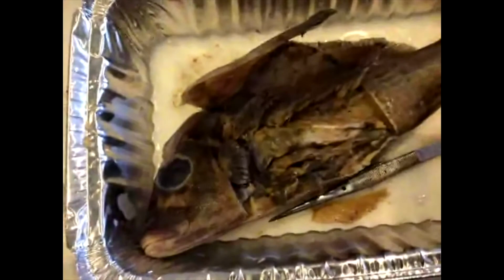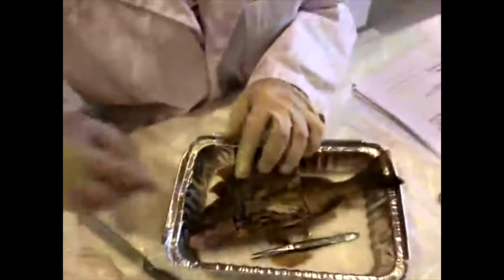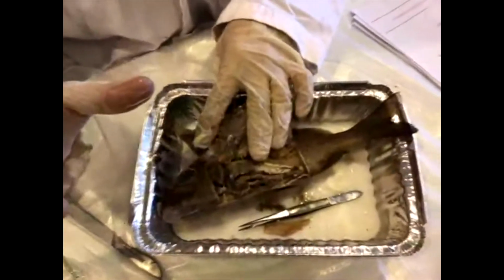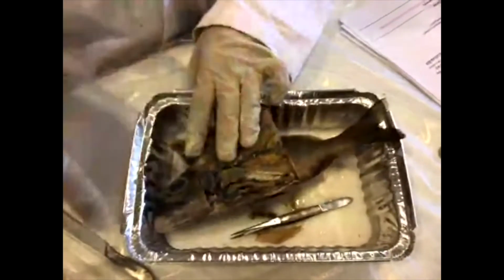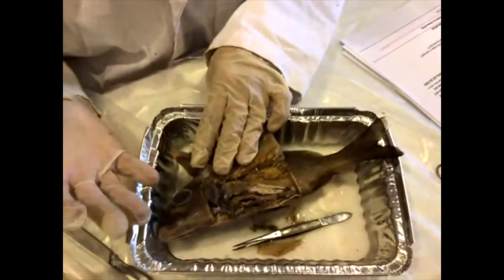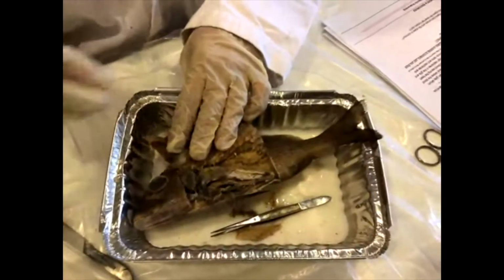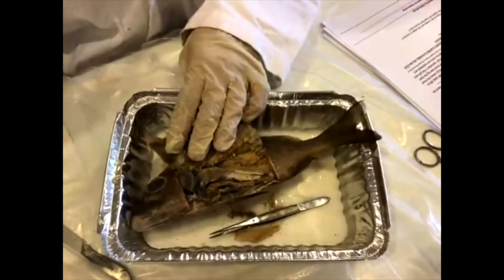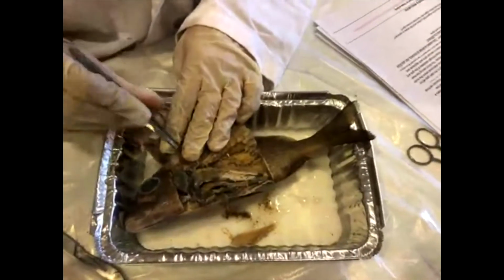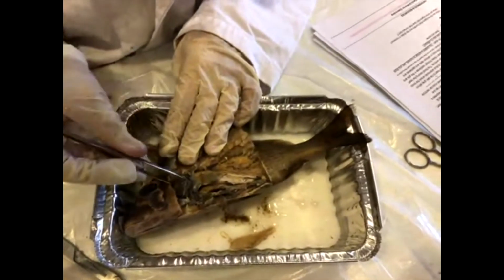So what we're going to do now is do our best to find the heart. And the heart is located right behind the gills. The gills are what take oxygen from the water, but that oxygen has to travel throughout the fish's body. And the way that they do that is with the circulatory system. That's similar to humans. We breathe air in, it goes to our lungs, and then our lungs have all kinds of blood vessels around them that absorb the oxygen, put it into our blood, and then ship it all around our bodies. So the same thing is happening. The gills are absorbing oxygen. There are all kinds of arteries that you can't really see, but maybe there's some dyed at the base there.